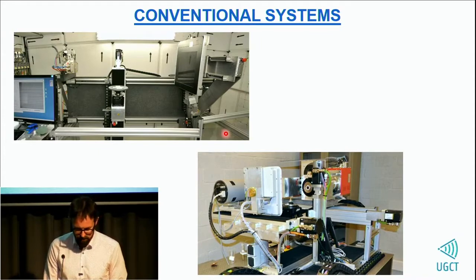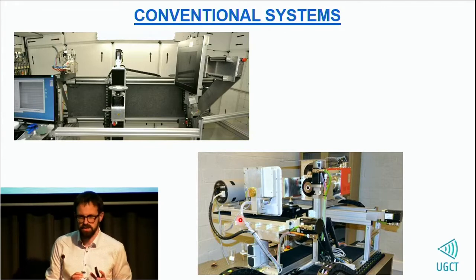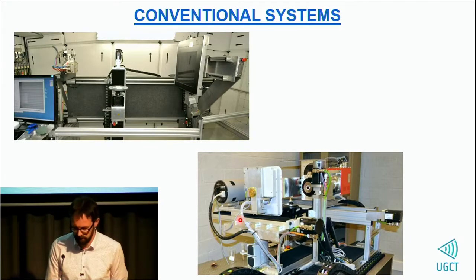That system is a very special one, also has two different sources, so we can choose at that system which source is the most useful for a specific application. And one of those two sources can go down to about 400 nanometers resolution, which is still really high resolution. It also has two detectors depending on whether it's a relatively heavy object or a relatively light object.